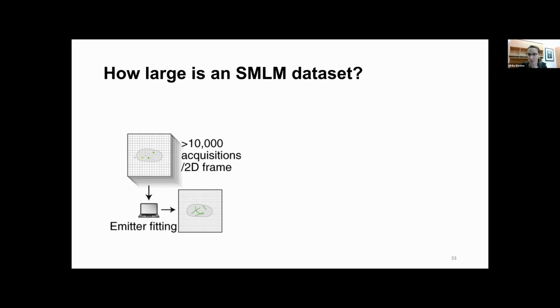If you have a strong computer that can perform operations on a specific image, keep in mind that here you're dealing with tens of thousands of images. That requires a good computer. In the most ideal case, you also have a cluster close by, which lets you do the operations faster. But this is really something people quite often underestimate.